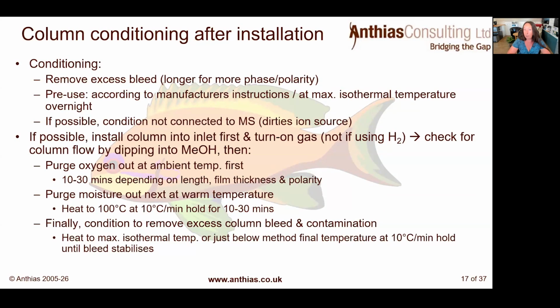So with our column conditioning, this is when you have a brand new column, or you've removed your column and you're reinstalling it. When we are conditioning a column, usually it's to remove our excess bleed, and it's always going to take a longer period of time if you have more phase, so thicker stationary phases, or a longer column, or a more polar column. Pre-use, follow the manufacturer's instructions.